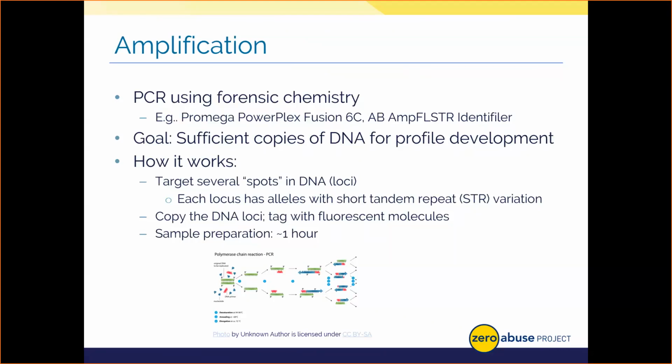You see, each locus is made of alleles or specific flavors of DNA, which we inherit from our parents. These alleles are made up of different sequences of DNA that have repeating patterns, called short tandem repeats, that are 3 to 7 letters, known as bases, in length. Basically, we can detect what allele a person has based on the length of their short tandem repeats.